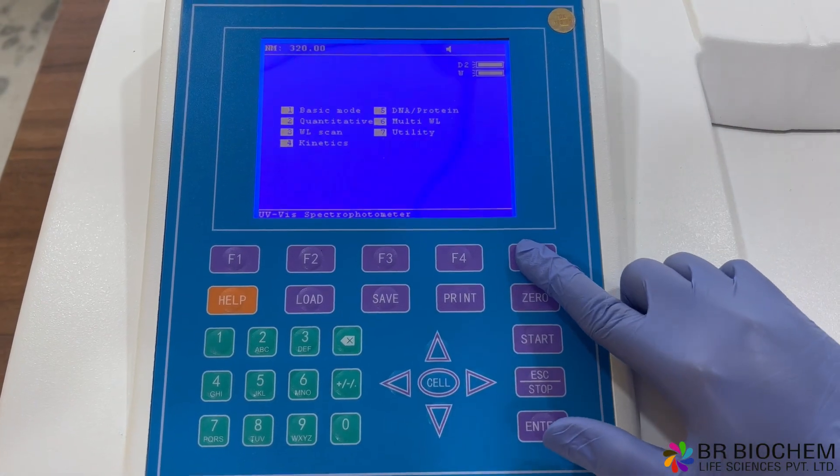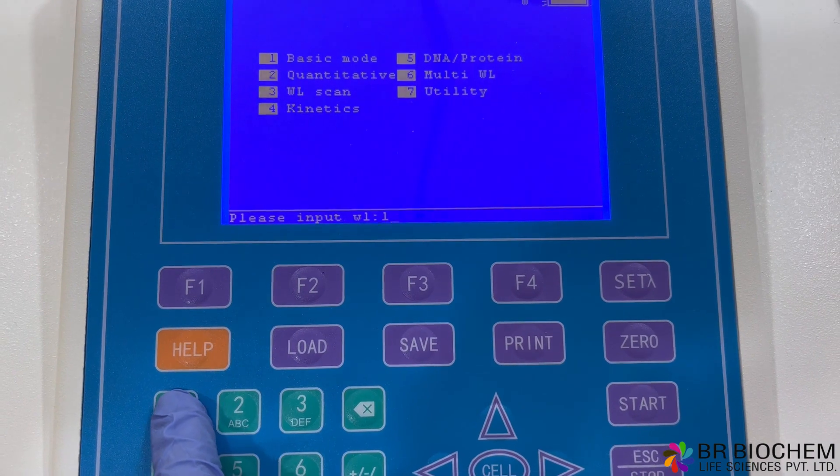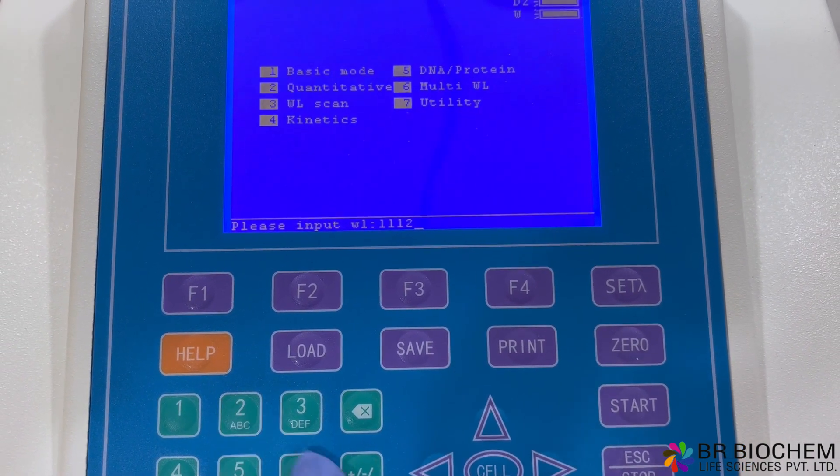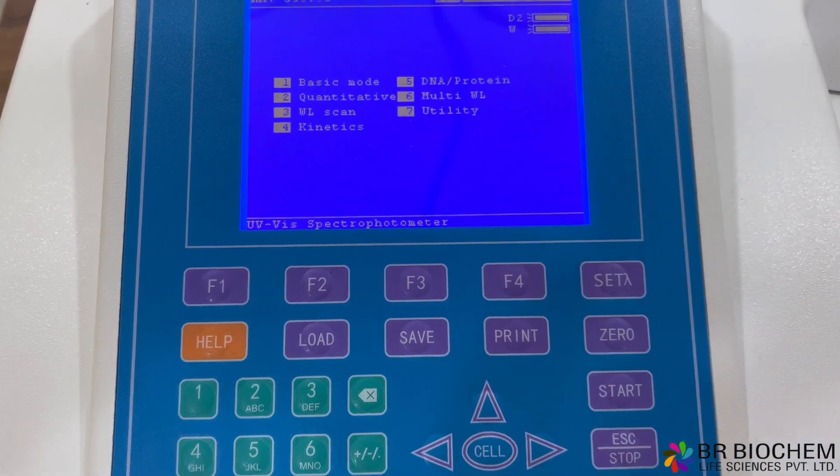With a wide wavelength range of 190 to 1,100 nanometers, our spectrophotometer allows you to analyze a diverse range of samples. The spectral bandwidth of 1 nanometer ensures precise and accurate measurements.